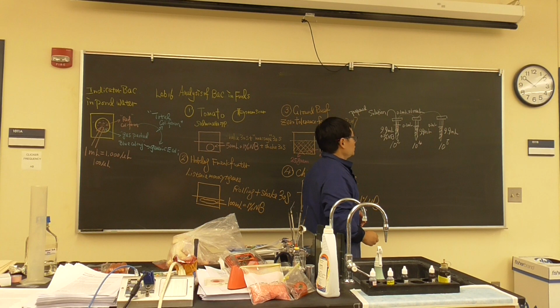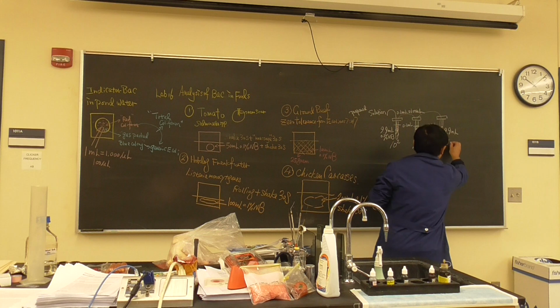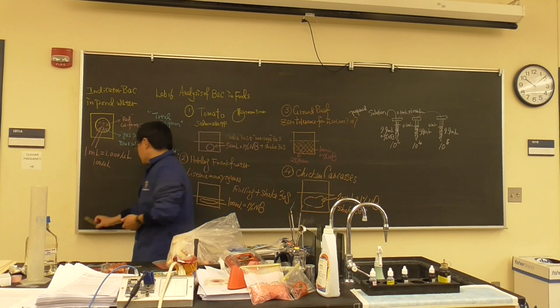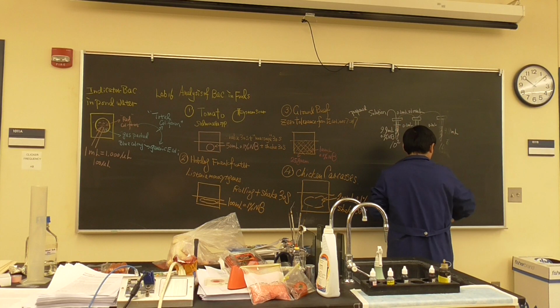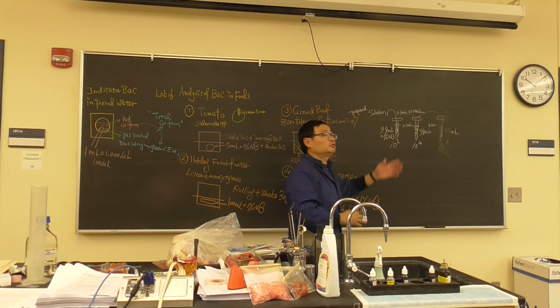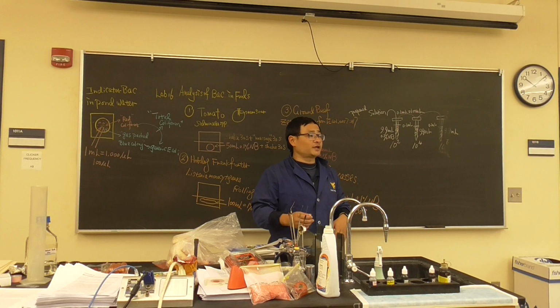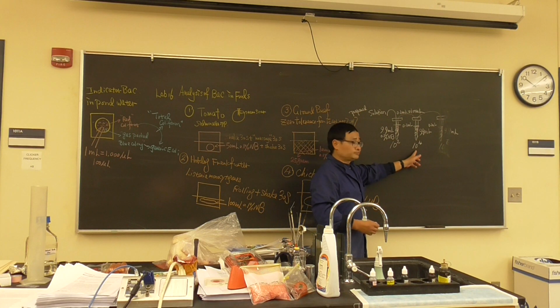Okay, do we think it is too much? It may be too much. Sorry, 10 to the 6. We took this out. We don't do that one because the dilution is too much. We don't expect more than 10 million bacteria on the chicken. So we will keep these two.